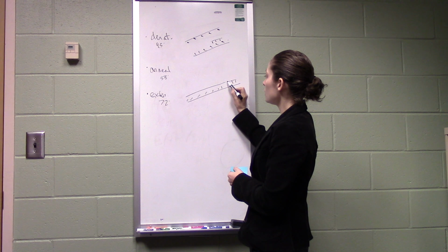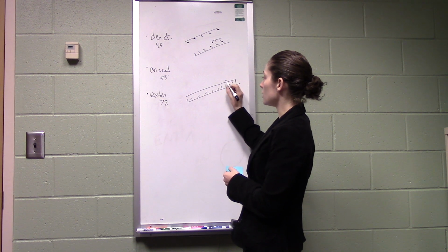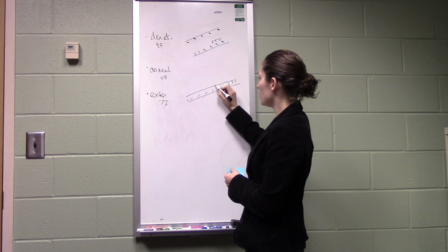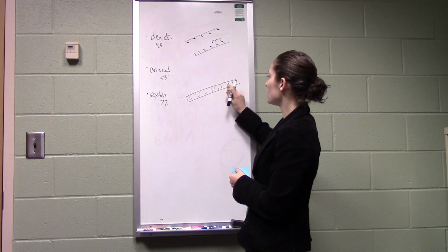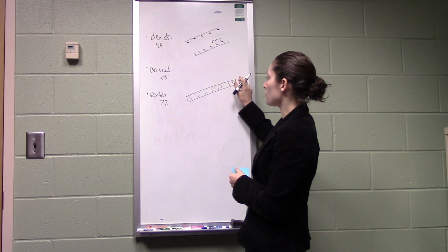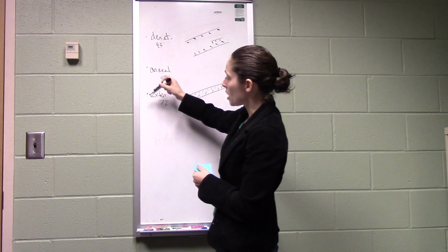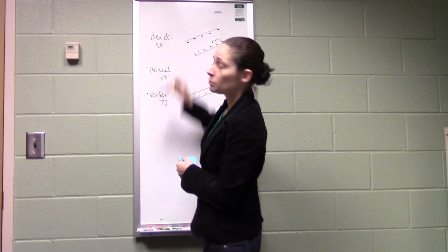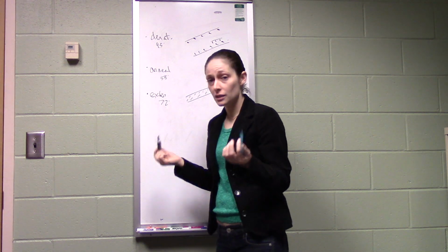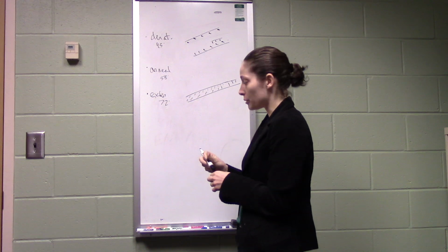So for this, the DNA polymerase is actually taking dNTPs and adding them based off of your template sequence, so it's covalently linked to your primer, and it all becomes one sequence at the end. And then, right, chain reaction, PCR, you repeat. So frequently PCR reactions will do this 30 times or more, making many, many copies of your original DNA template.